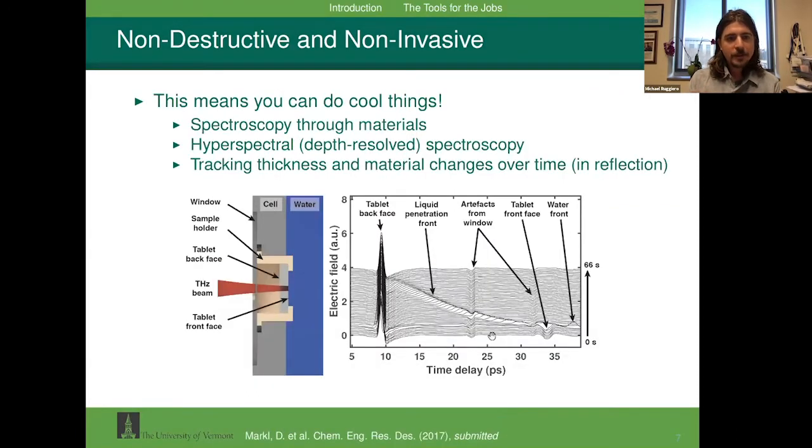One cool thing with terahertz, because it's transparent, is that when I was a postdoc, we set up an experiment where we actually watched water go into a drug tablet, to try to understand what happens to that tablet as it's dissolving. What we basically do is we shine the terahertz light on, we detect it, and this signal here that's moving up in time is the water progressing into the tablet. So we can get understanding about how complex processes occur. All of that has nothing really to do with what I'm going to talk about.